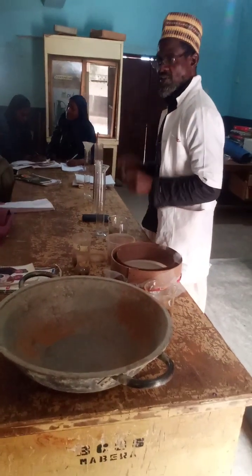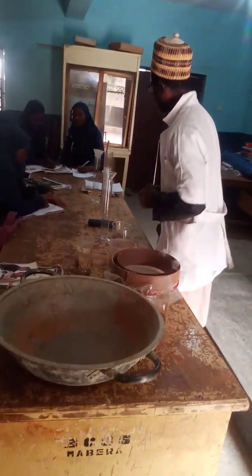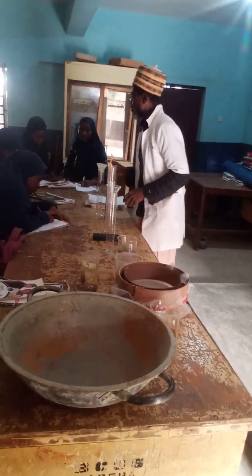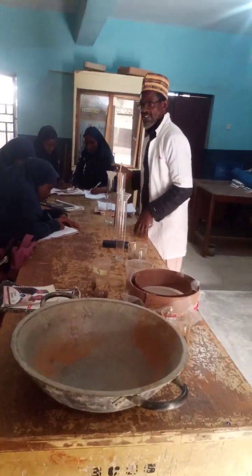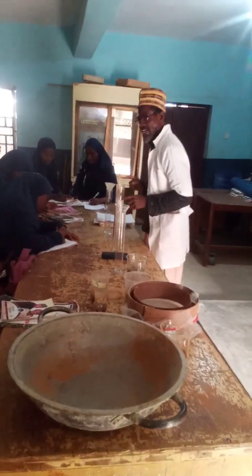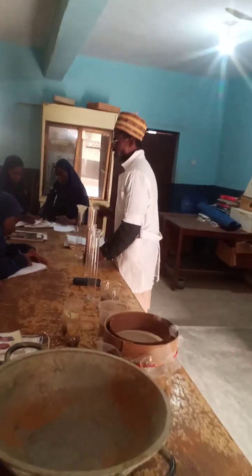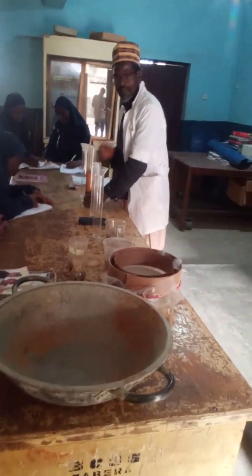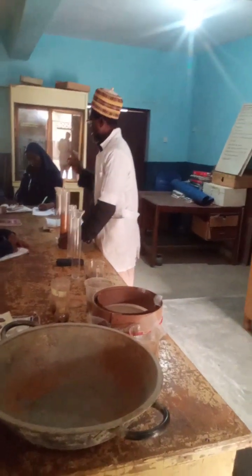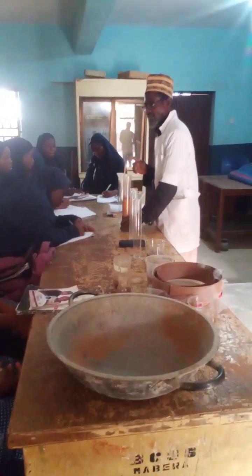Of determining soil particle size. The first method is what is called the sedimentation method, from the word sediment. In that case, the aim of the experiment is to determine the particle size of the soil.